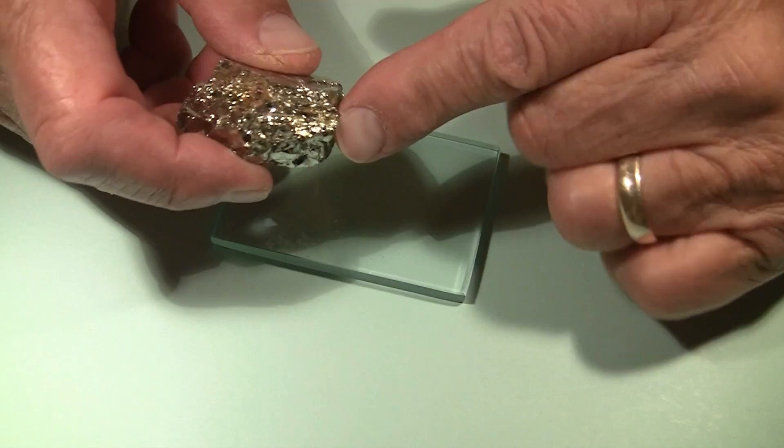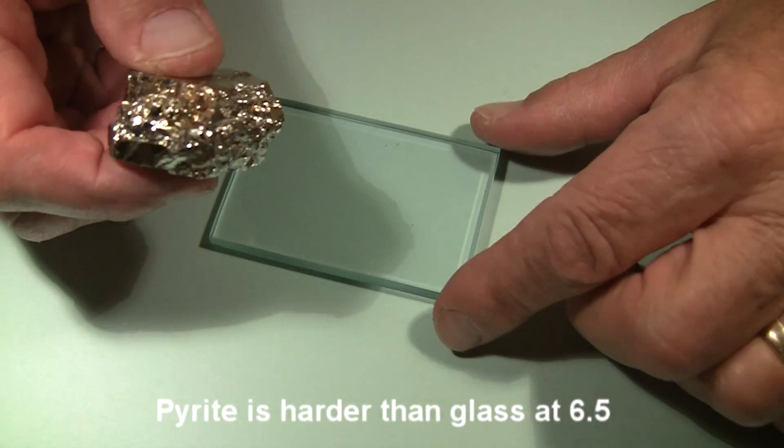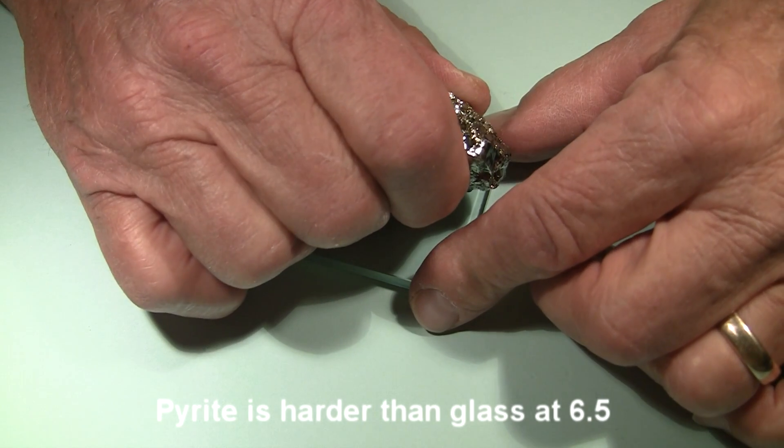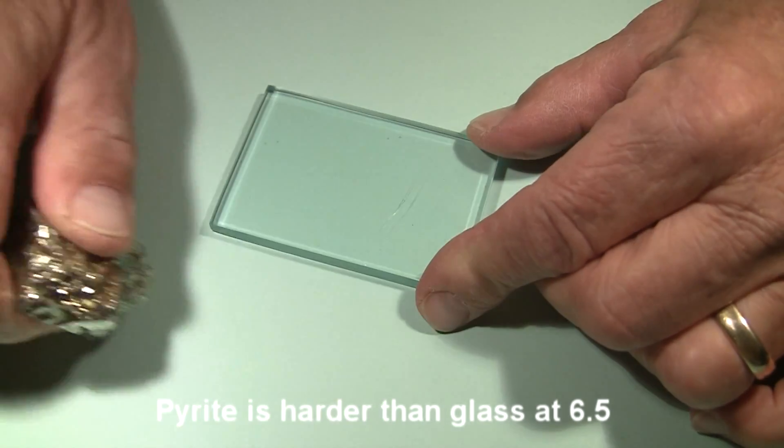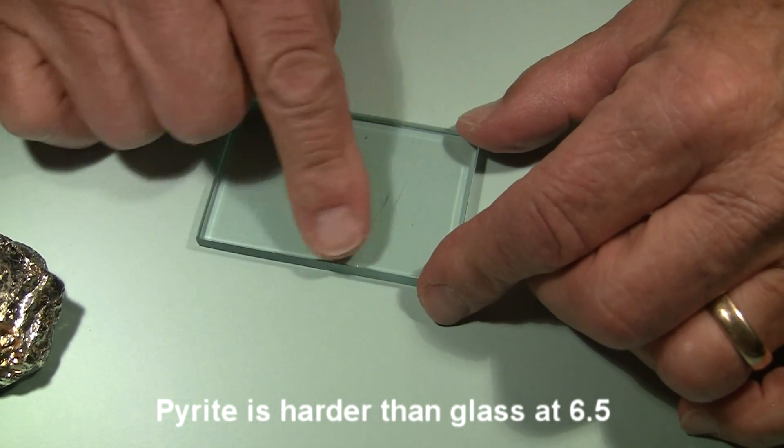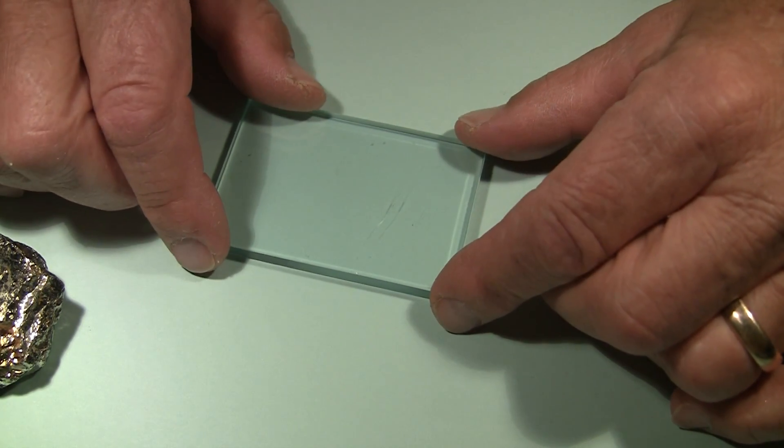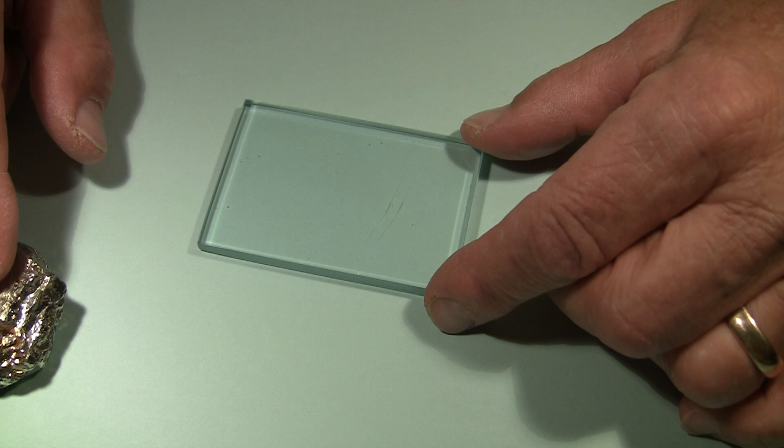And again, with just fairly light pressure, I'm looking for a nice point here on this chunk of rock, and rub it across here. It definitely scratched the glass. So that is a positive test for pyrite.